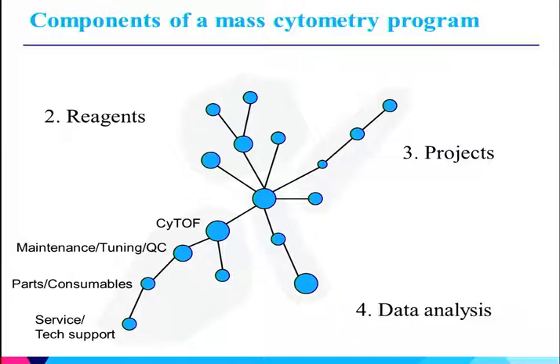So also the CyTOF, unlike, let's say, a traditional flow cytometer, isn't entirely just a standalone instrument. You actually do have to have connections to ventilation systems in the room, and that's an underappreciated and very important aspect of setting up a facility. So a good relationship, again, with facilities support and building maintenance is another really important factor when you're thinking about setting up one of these programs.